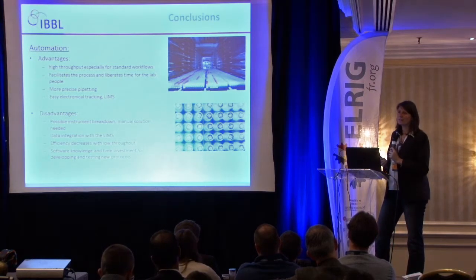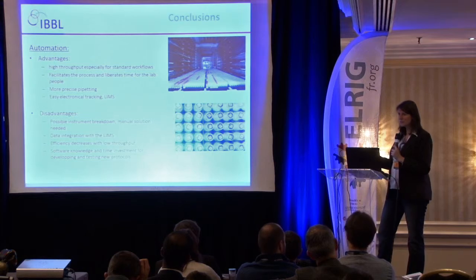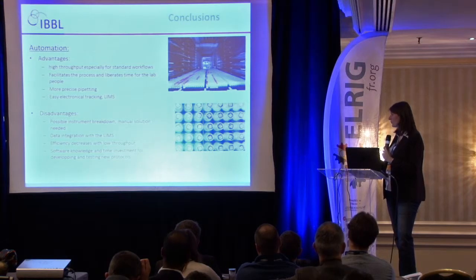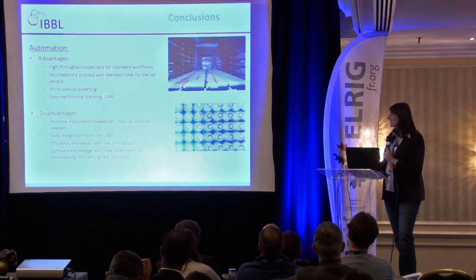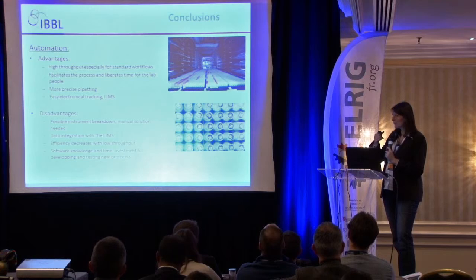And if you have, for example, one day where you only have 2 samples and you have a 96-well extraction plate, then your efficiency is not really high. So the efficiency decreases if there's a low throughput. And then something that we underestimated in the beginning, but we now know, is that you really need to have in-depth knowledge of the software if you don't want to call the tech service each time, who will tell you we will come soon.